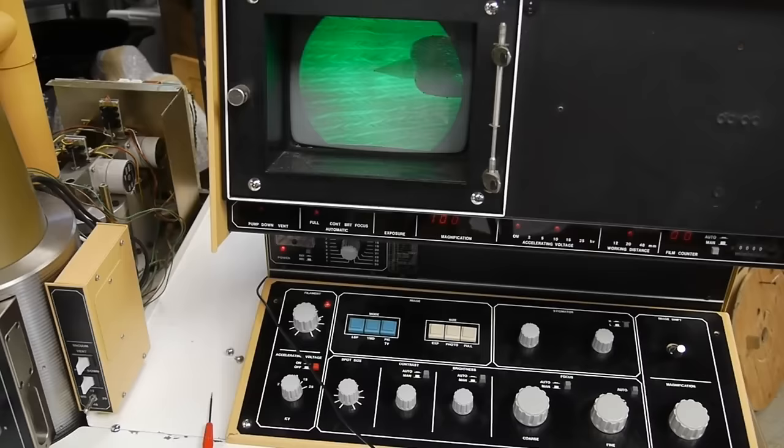After getting everything aligned and turned on you can see the video image that the electron microscope creates. It is possible to get real-time imagery running at close to 60 fields per second, but the resolution in this mode is quite poor and the contrast is very low.